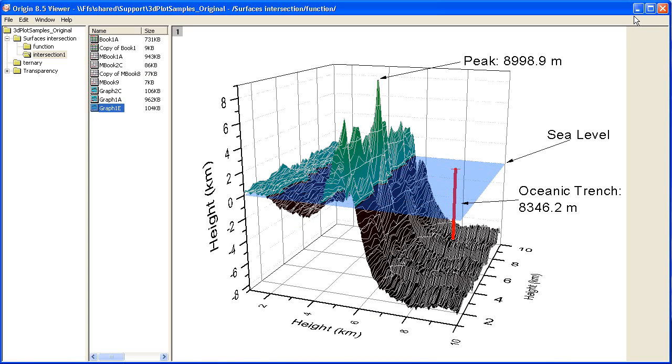For co-workers and collaborators who do not use Origin, the Origin Viewer saves you the step of exporting your data as ASCII or saving your graphs as image files. You simply send them your entire OPJ file.